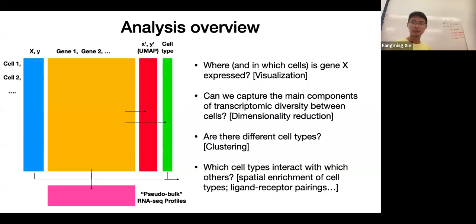So for coding, there's just two exercises today. First, we'll do clustering. We'll do the simplest possible clustering called k-means clustering. And then after clustering, each cell has a cluster label. We will try to calculate the cluster centroid gene expression, the mean gene expression for that cluster on average for all the clusters.